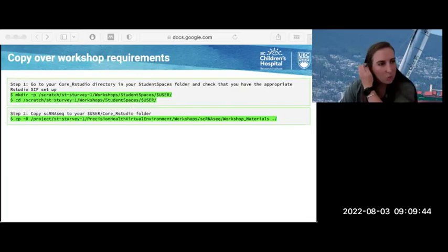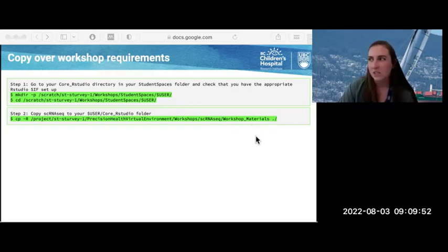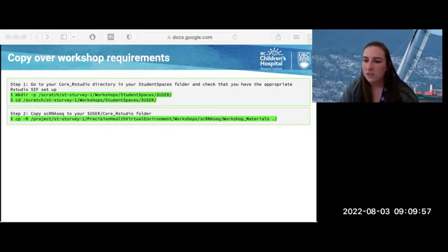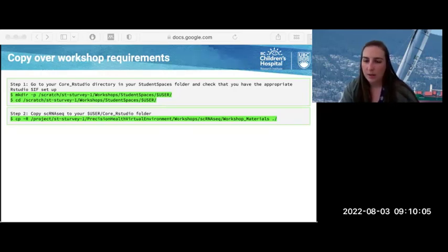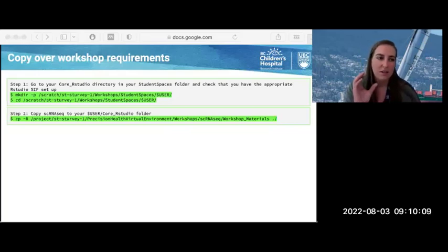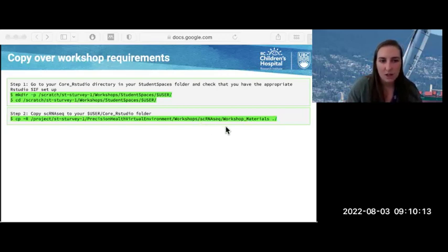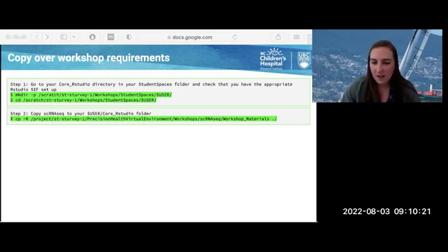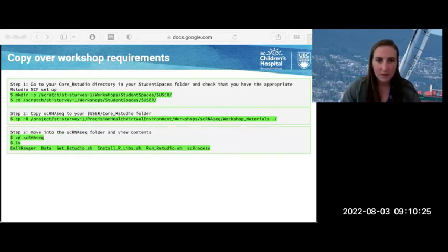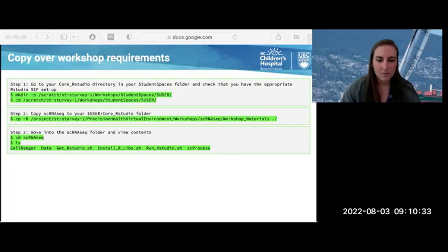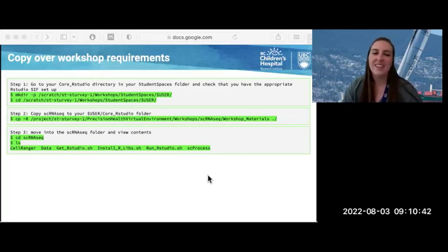Once you've changed into that directory, you're going to copy the single cell RNA sequencing environment. There's no workshop materials folder, so that actually needs to be updated. The correct file path is going to be cp -R and then Project st-sturvey-1 Precision Health Virtual Environment Workshops SC RNA-Seq — leave the workshop materials part off. So it should be Project st-sturvey-1, Precision Health Virtual Environment, and then SC RNA-Seq — not workshop materials.